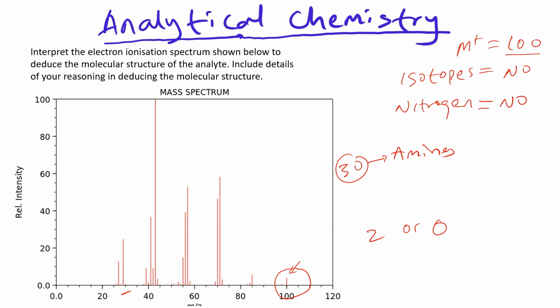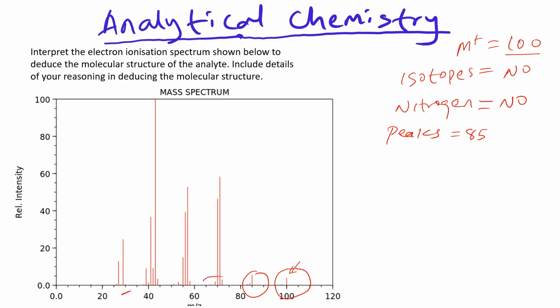Now let's look at the clusters, the fragments, and then identify the peaks there. In this cluster here, we have peaks at 85 and 71.